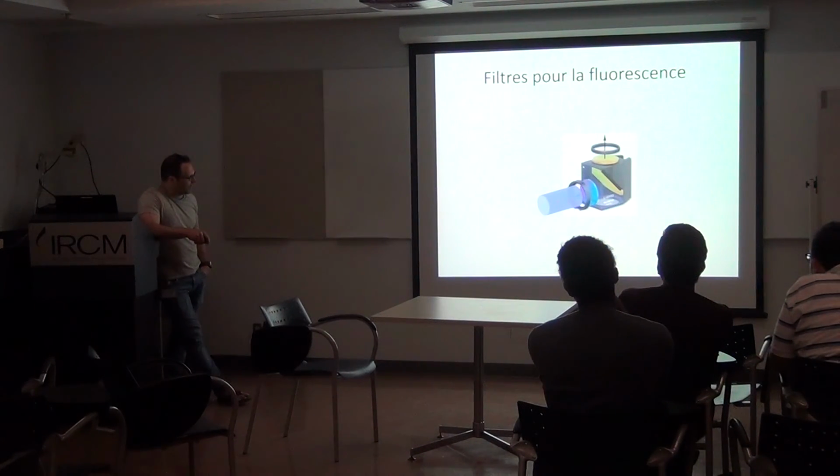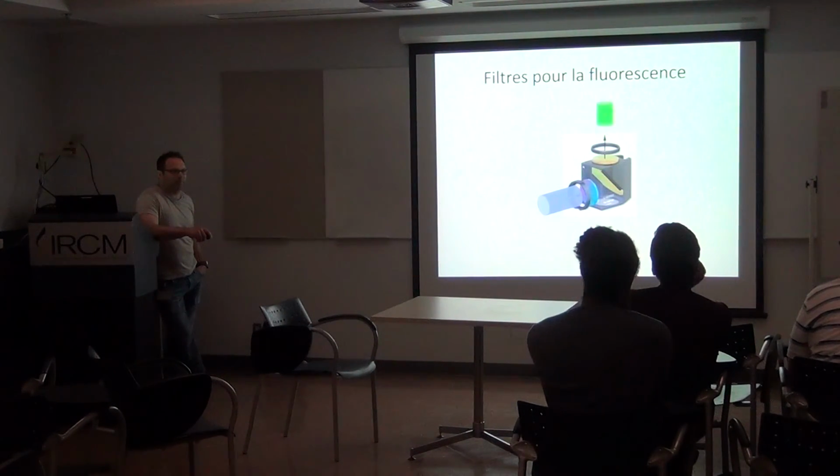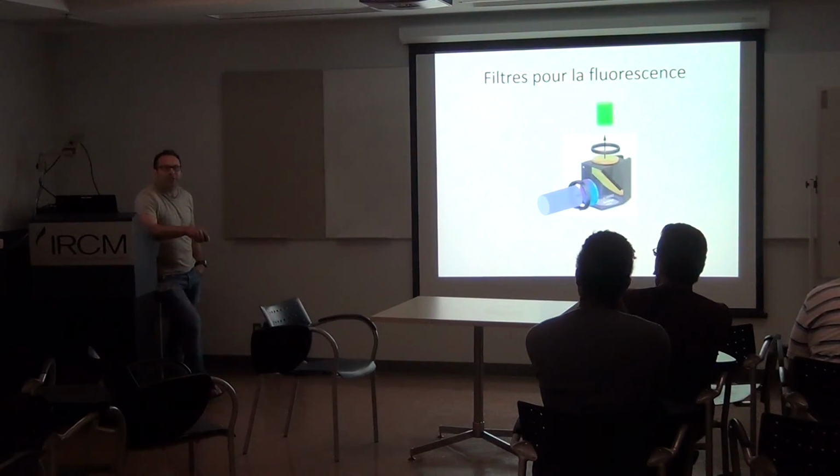Blue light. Then your specimen absorbs the blue light and emits green and red. And so green will go through this glass, and then you're going to see only the green. Okay? So let's play it again. Blue, excite, fluoresce, poof, goes back. That's how you distinguish the green from your GFP.